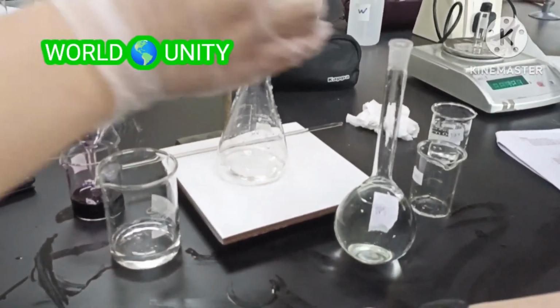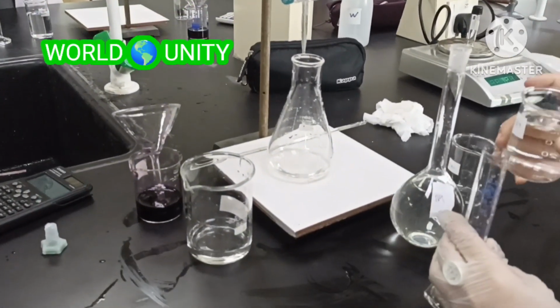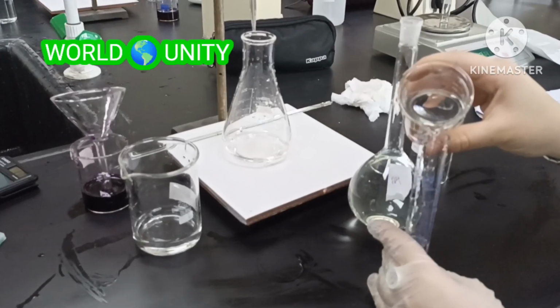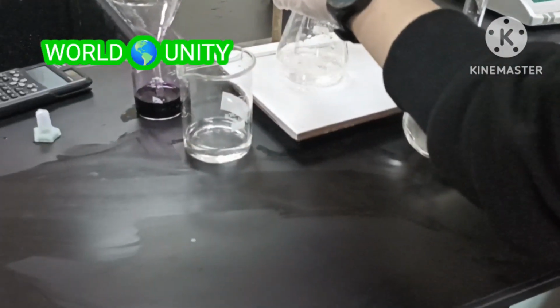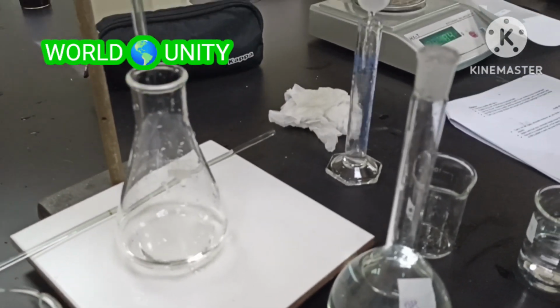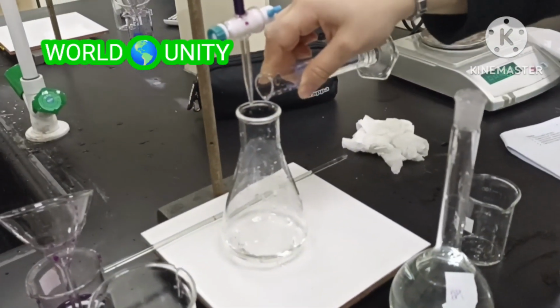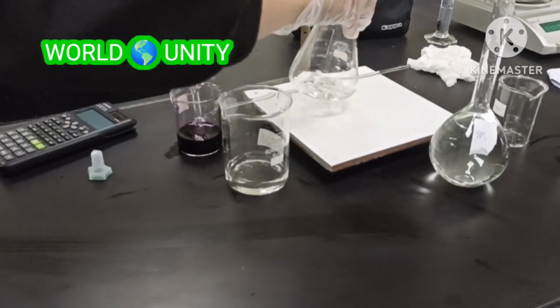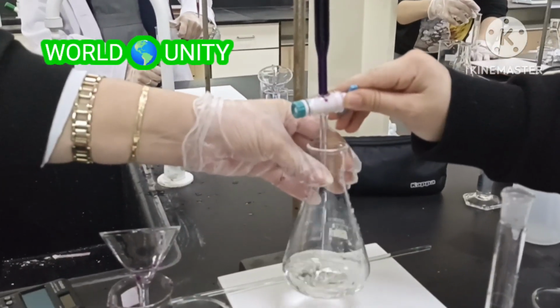And then 15 ml of FA3. Really? Okay, we got it. Yeah, 15. From where? Then put a little bit of water. Oops, only a little, don't put all. You just rinse only the flask. Okay, then swirl. Now, slowly.